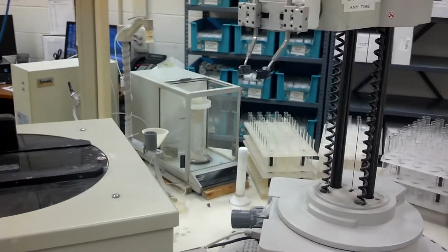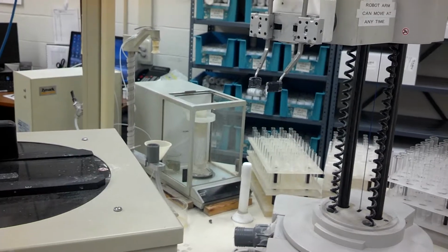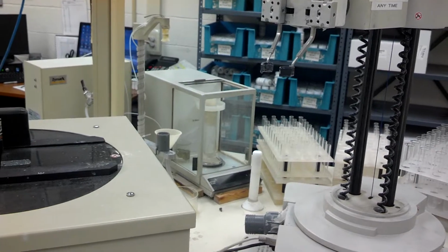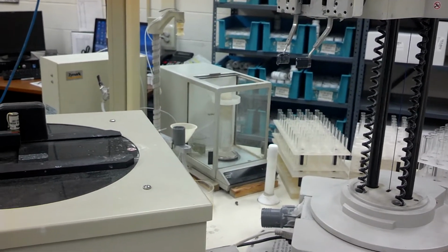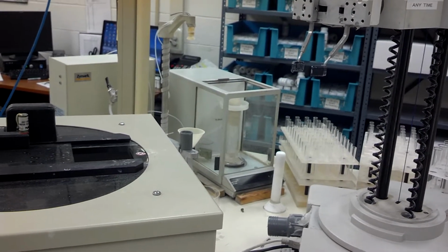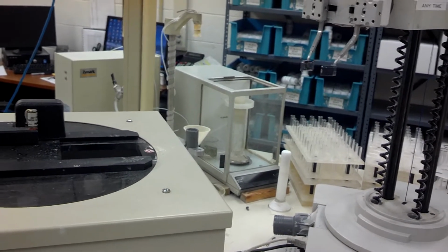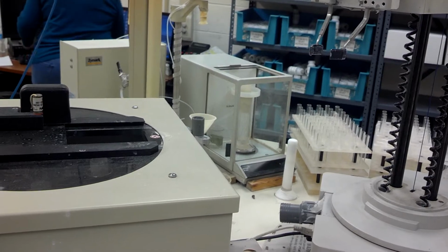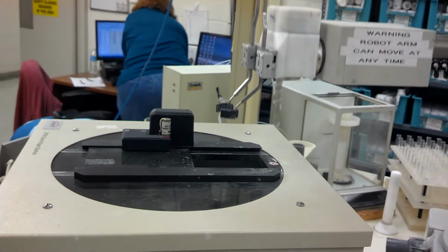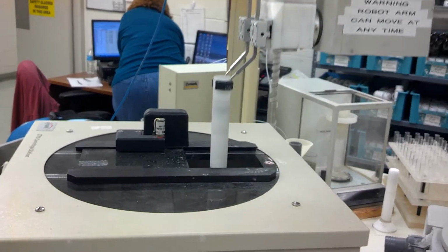I want to show you something we did for PepsiCo. Okay. It's a little different type of process. Now, what does the centrifuge do? The centrifuge, so what happens is the water that's left on the pores, we get a weight from that, and then it does a calculation, and whatever is left on there gives us the pore volume. So the purpose of the centrifuge is basically to precipitate any water out that doesn't really belong there. The water's going through the filter at the bottom, right?